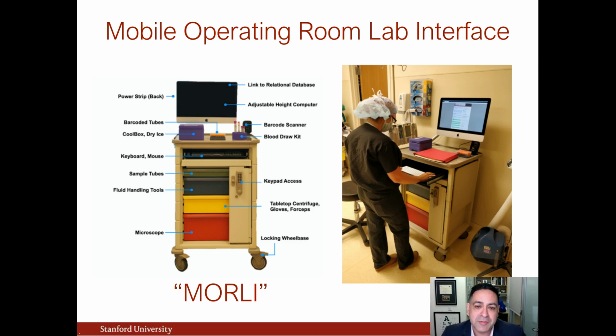This also includes getting the patient consent in the preoperative area, capturing patient data and information, and then putting the fluid into permanently etched barcoded tubes that are safe and appropriate for putting in a -80. Once this fluid is collected, it's stored in a nearby -80 freezer, and we use a database to track each of those tubes in an XYZ system, so we can address the challenge of finding the patient tube with the disease that we need, which could be months later.